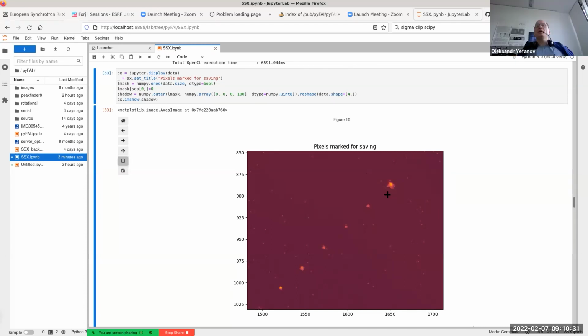So basically, do you process every half-megapixel image separately here, or do you merge first, because Jungfrau has a separate output for data from each module? So do you first merge them together, or do you process every one? First, we perform the image reconstruction. But this also takes time, right? Yes, but it's done on a different part of the computer. So the computer is built up of different parts.